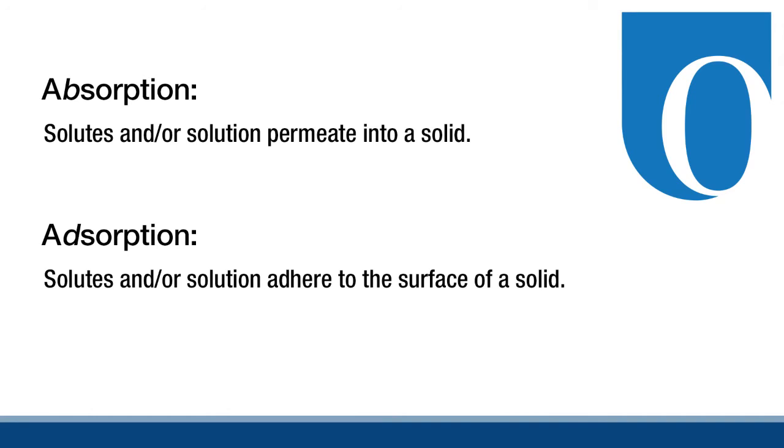Displayed on screen there are two definitions, absorption and adsorption. You are likely more familiar with the term absorption. Absorption refers to a solution actually permeating into a solid. The common example used to explain this is a sponge. Water will actually enter inside the sponge. Adsorption is a little less intuitive.